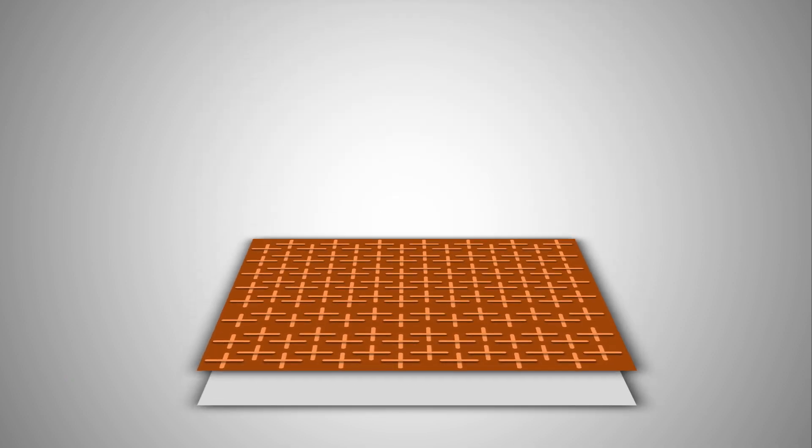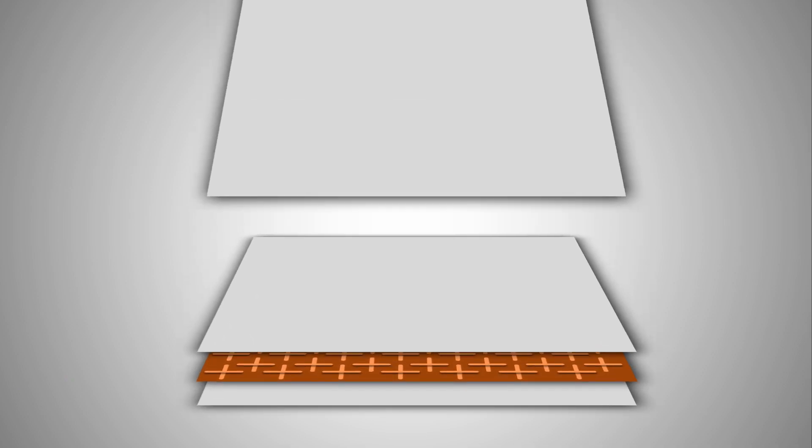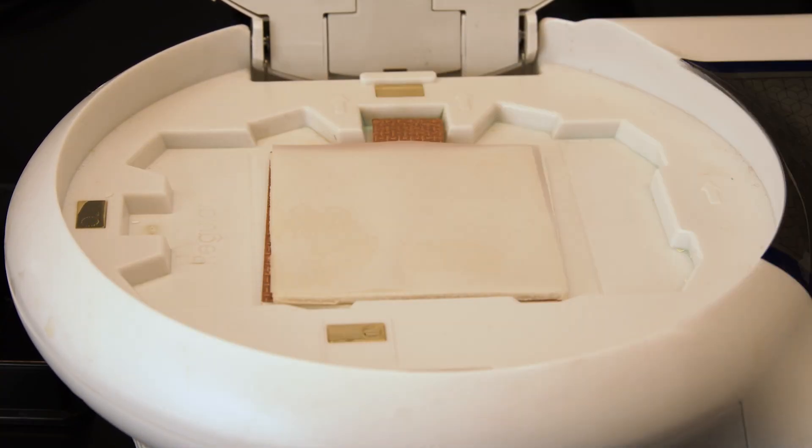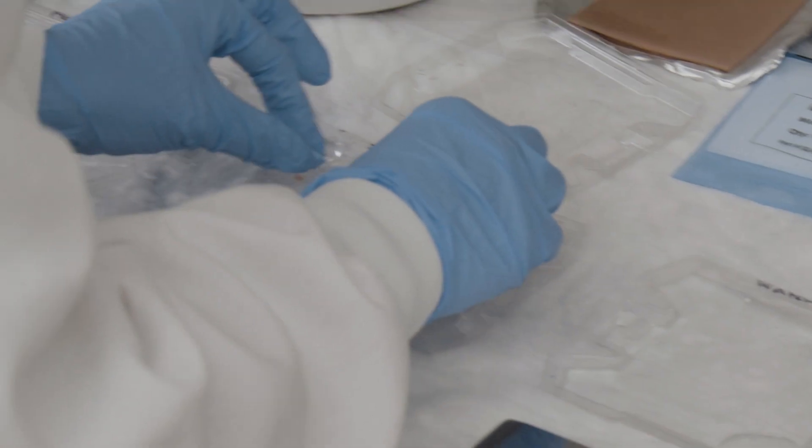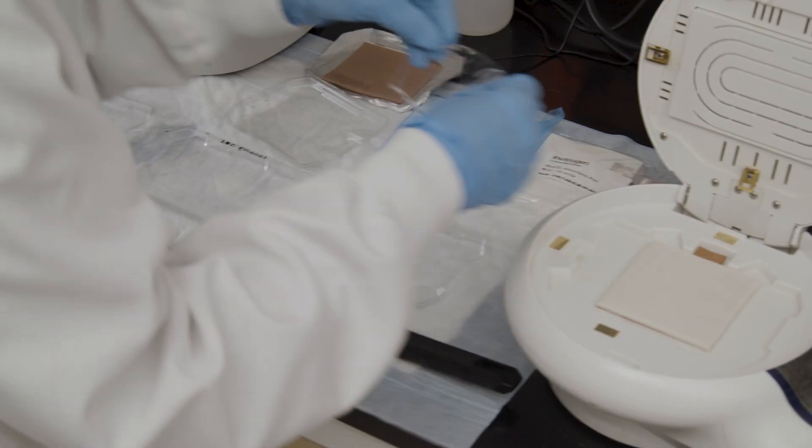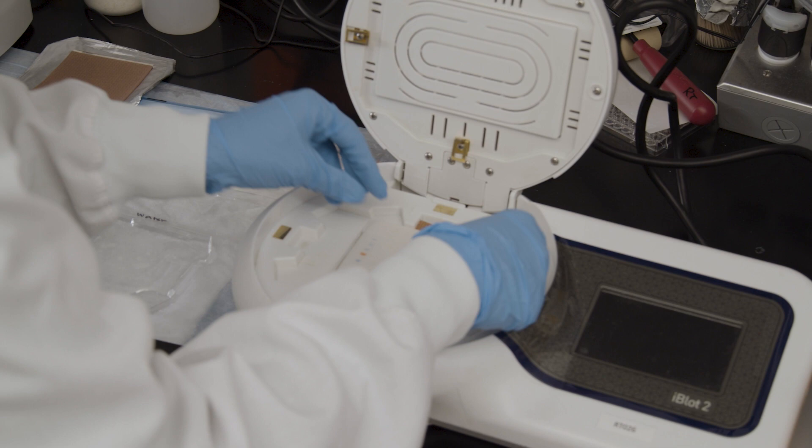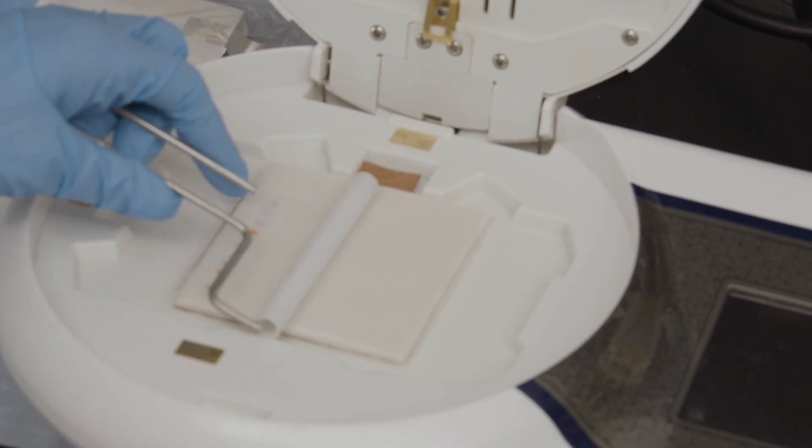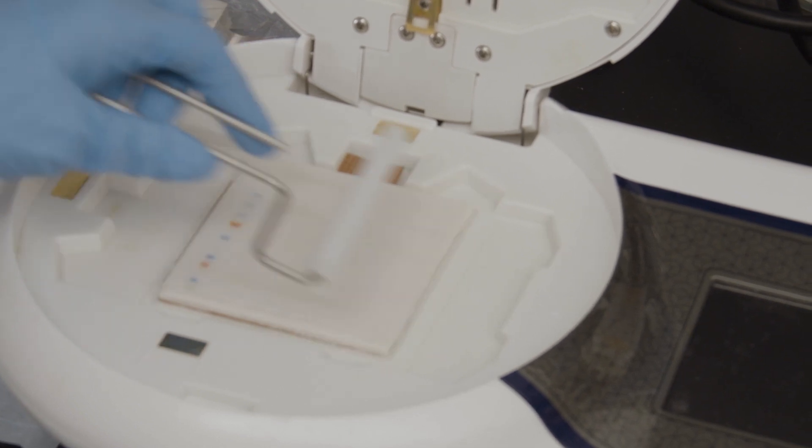To assemble your transfer sandwich, make the bottom stack like so. Absorbent pad, copper anode, anode stack, and membrane. Place the blotting apparatus such that the electrical contacts are aligned. Shake excess liquid off the gel and gently place it on top of the membrane. Use a roller to gently remove any air bubbles between the gel and the membrane.